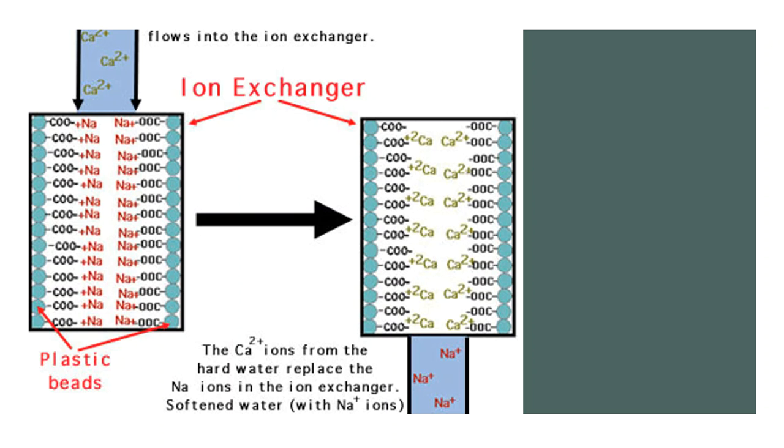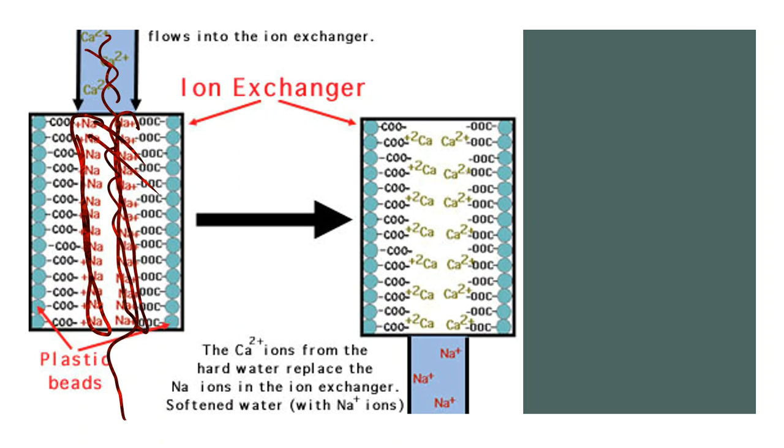Here's a diagram of an ion exchanger. So basically what this is, is a sodium loaded compartment. You can see all of those sodiums that are listed right there. And calcium, whee, it's like a water slide. Whee! And then out the other end. So that calcium flows through and that calcium says, you're going to be picked off, and you're going to be picked off, and you're going to be picked off. And then all of a sudden, we start to see these calciums get loaded up on the outside of that resin bead, is what we call that. All right, so all of the sodium now just gets flushed out with the drinking water.